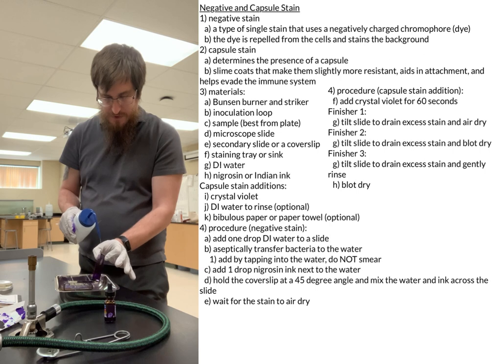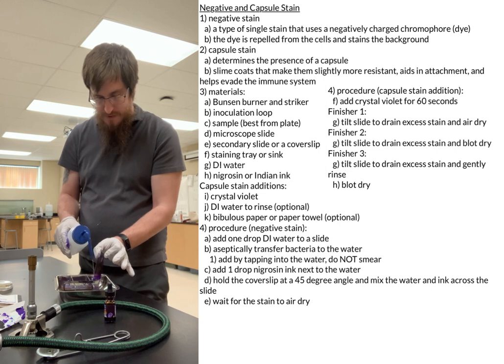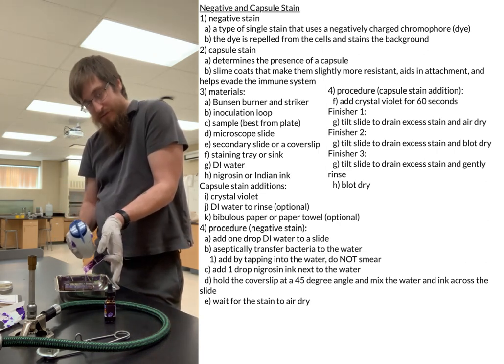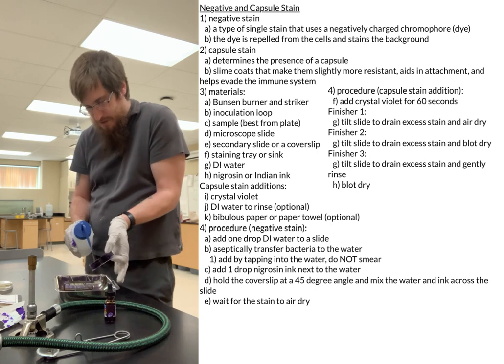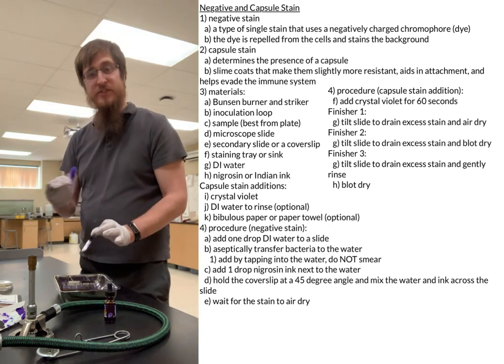Just gently rinse from the top and give it a little bit of a chance to get some of that excess stain off. Come down to the bottom, kind of get some of the extra off, and then kind of rinse off of the back. Maybe give it a little more on the top here, a little bit on the bottom, another run on the back there, and then that's basically all that I'm going to do.